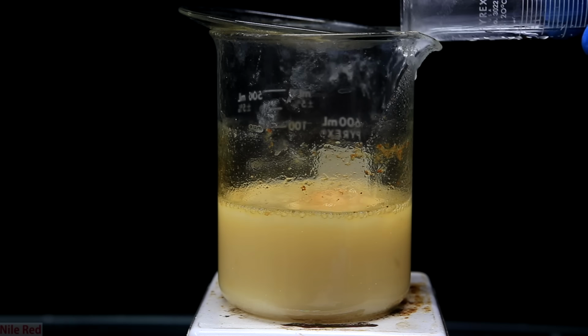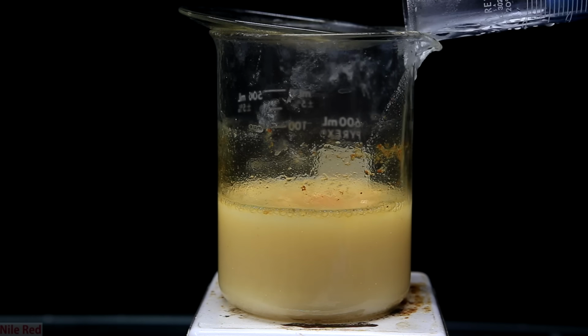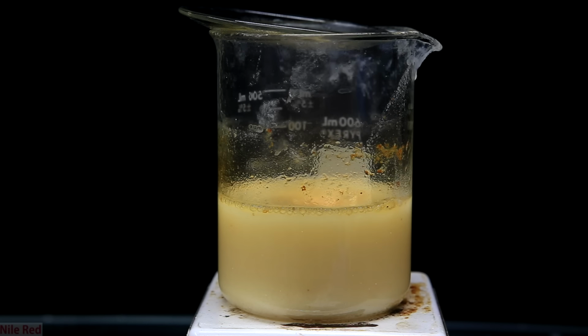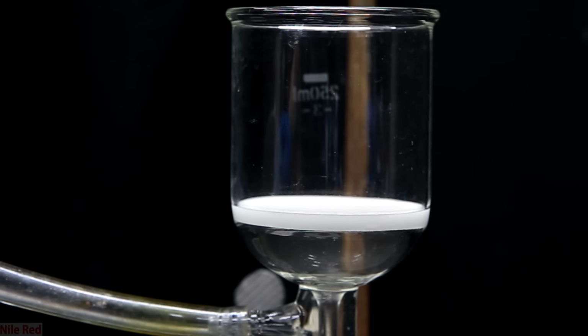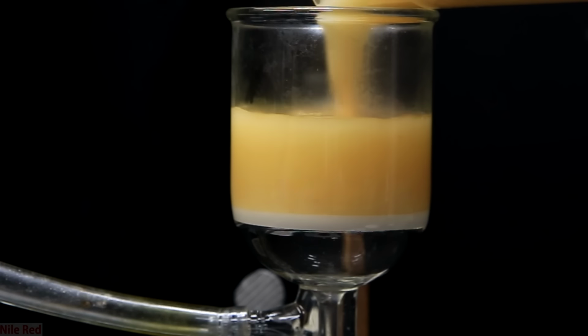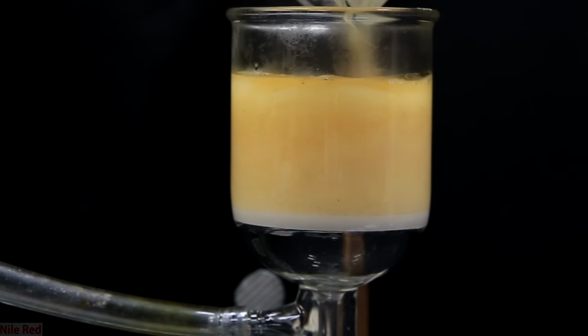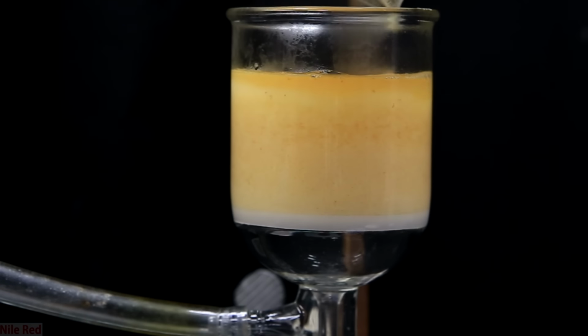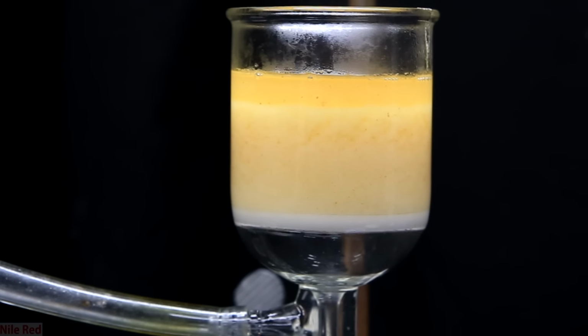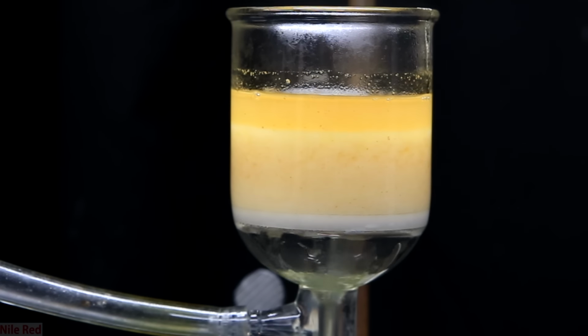If you do this reaction, you also might get a brown colored solution, and this is also okay. More dilute triiodide solutions are yellow, but the higher concentration is brown. After the reaction with the hydrochloric acid, there was a lot of precipitate which needed to be filtered off. The precipitate is likely just a lot of sodium chloride produced in the neutralization. This can be avoided if you limit how much sodium hydroxide you use in the beginning.